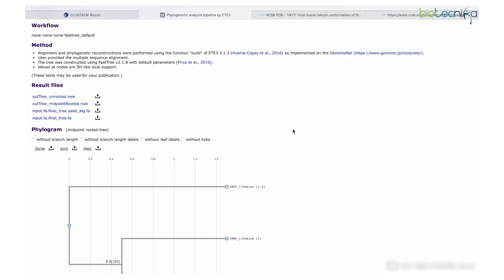So today we have taken an example of a protein, seen its evolutionary connections, and looked at sub-branches in the phylogenetic tree. That is a quick demonstration of the multiple sequence alignment tool called ClustalW. If you have any questions, comment down below and let me know what you want to see next. Thank you and have a nice day.